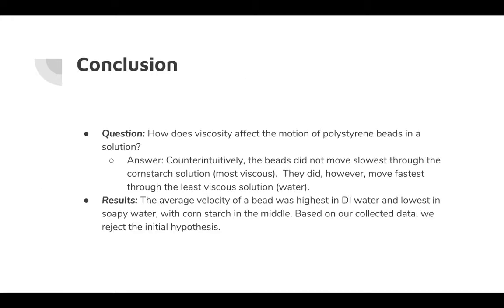So in conclusion, just to recap, our question was about viscosity affecting the motion of polystyrene beads in particular solutions. And our answer to that question was that the beads did not move slowest through the most viscous solution, but they did move fastest through the least viscous solution.